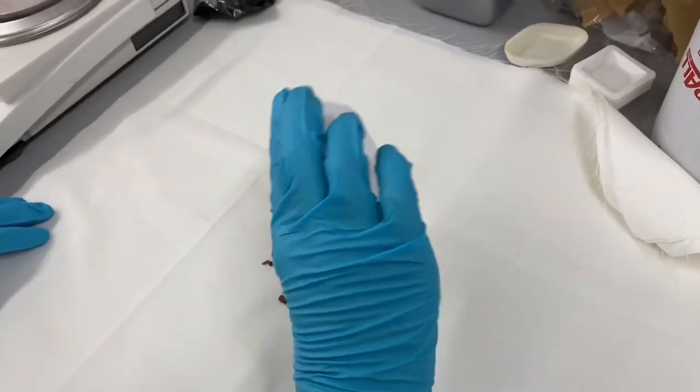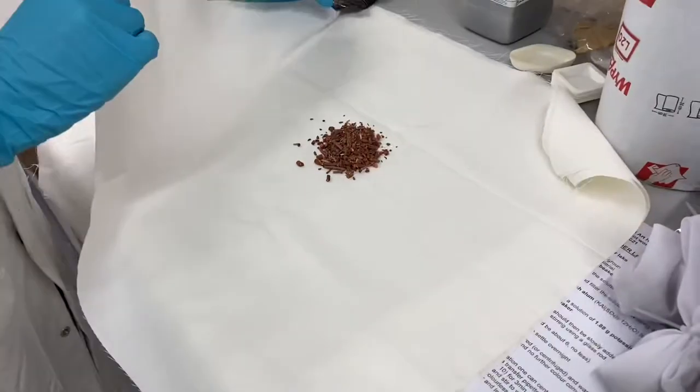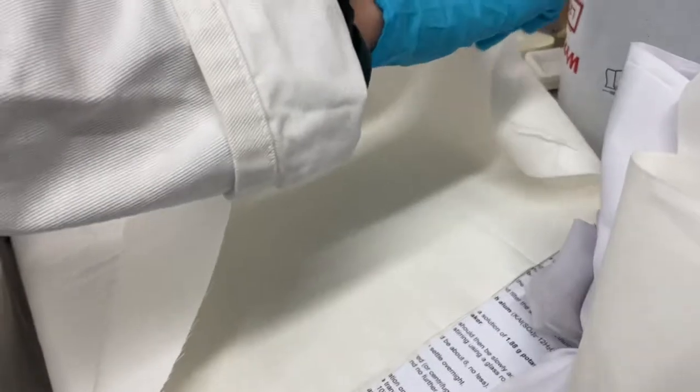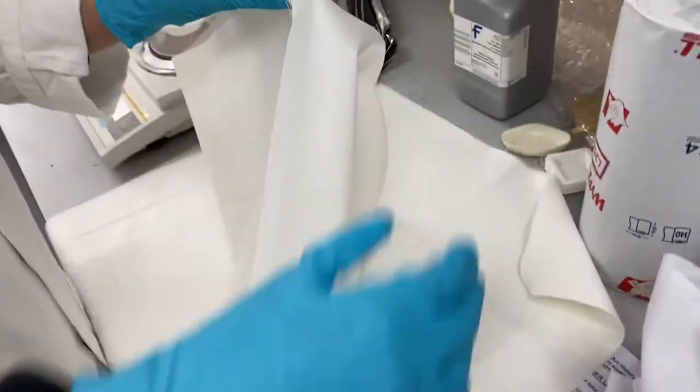These particular madder root fragments are from Turkey and we begin by putting 10 grams of the coarsely ground root in a netting bag so that we can soak it overnight in a beaker with water.